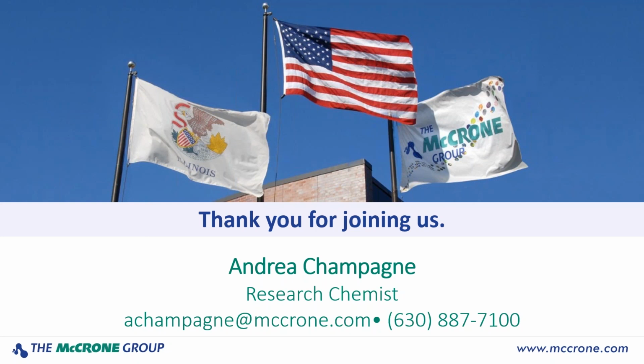Okay. Question from Mary Lee. Do you have microtome capability for foreign matter embedded in a solid matrix? We do have microtome capability. We also, in some instances, have found that hand cross-sectioning is easier, and that is something with response to an earlier question on my particle picking. No, I'm not as skilled with that. But depending on the nature of the substrate, sometimes you can actually get a cleaner cut with a well-trained microscopist, but we do have a microtome as well.